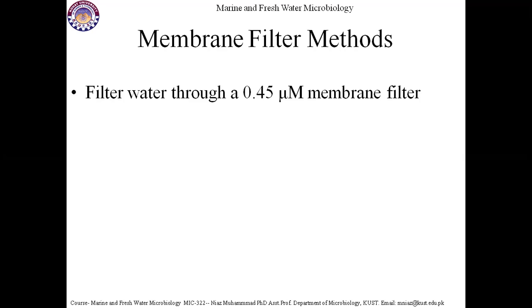So what will we do? We will collect this membrane, because all microorganisms which were present in the analyzed water sample have been trapped in the membrane. We will collect that membrane and place it on selective media.